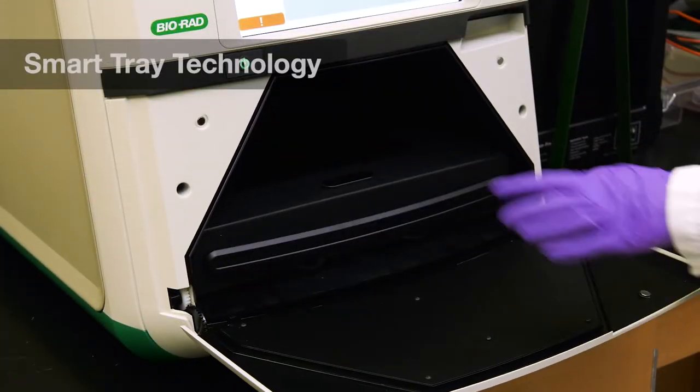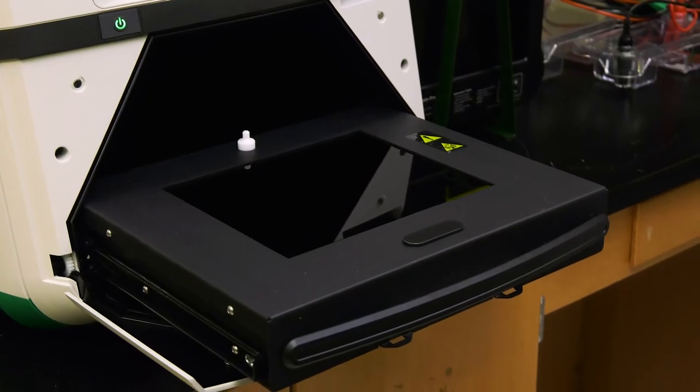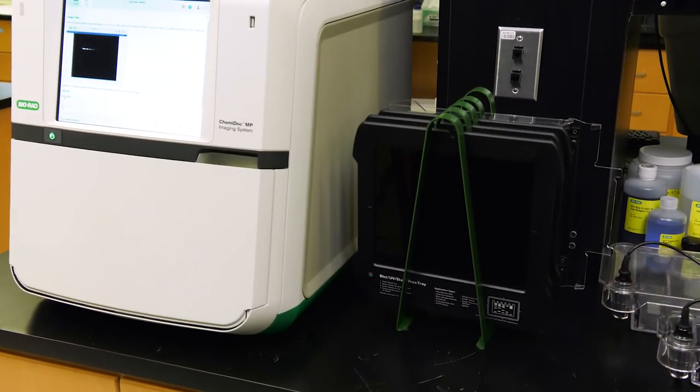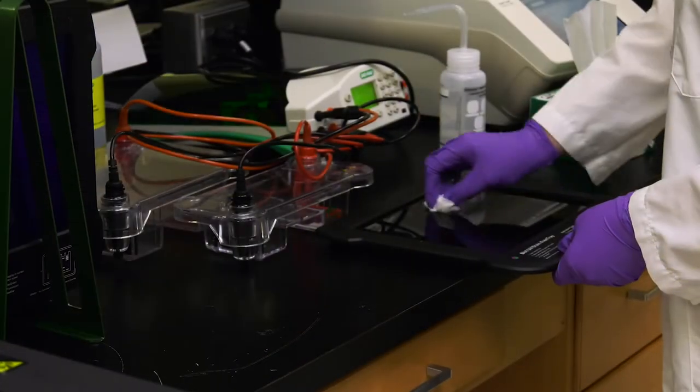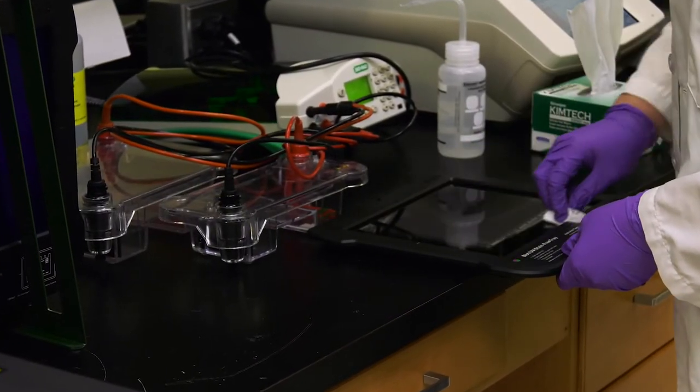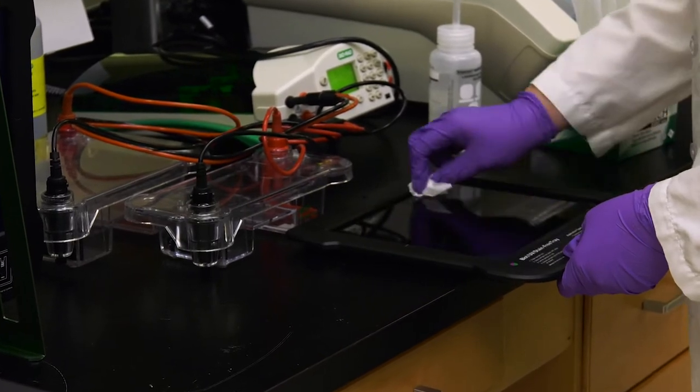To begin, open the imager and pull out the transilluminator. Note that all gels and blots will always be imaged on one of three trays. It is easy but important to clean the trays. Simply use DI water and a ChemWipe to ensure optimal performance.